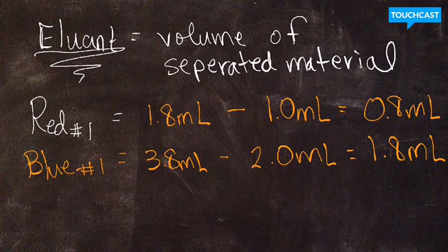You'll want to continue calculating all the bandwidths all the way through for each of the trials for red and blue. So that should help you with number 6, part A. Let's start looking at number 6, part B. In part B, they want you to find the very center of the band where most of the dye was pouring through.